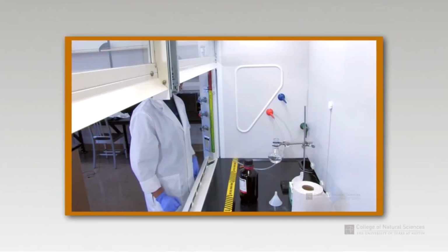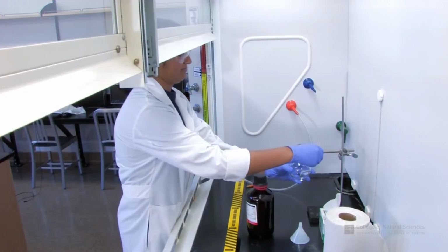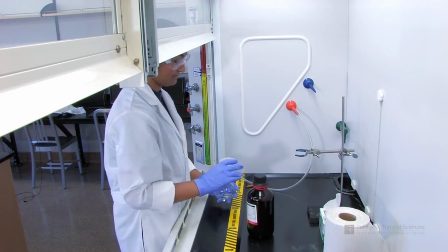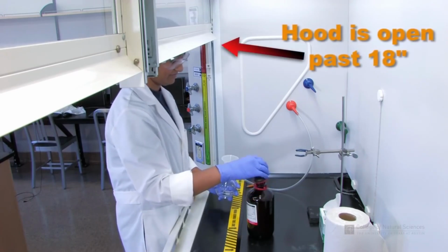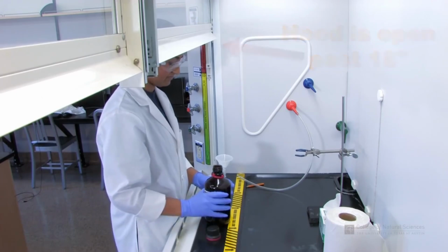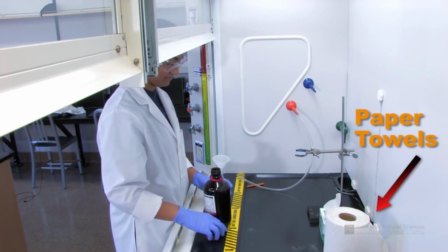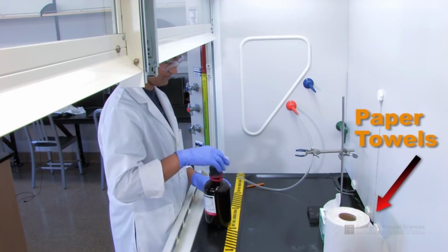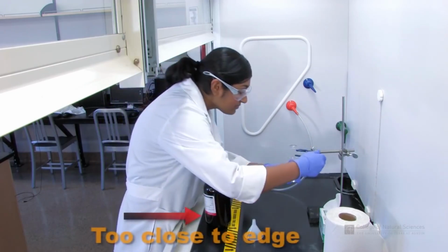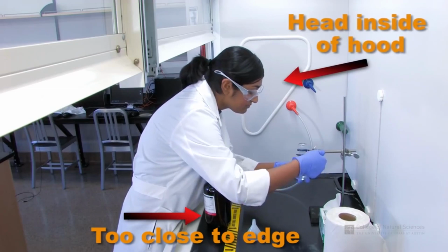Watch this short clip of a student working in the fume hood. Can you identify any unsafe practices in the video? First of all, you should notice that the hood sash is raised all the way up, instead of keeping it within 18 inches. There are paper towels stored in the hood, which is a fire hazard and may decrease hood efficiency due to turbulence. The student is working too close to the edge of the hood and leans in to do her work.